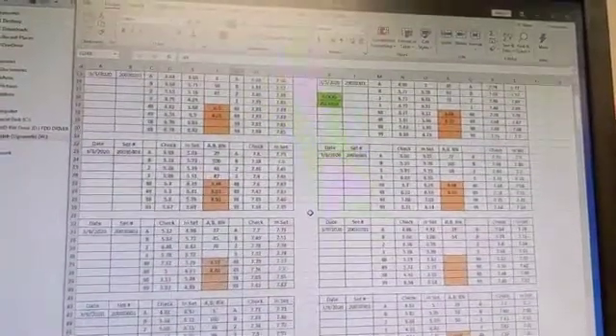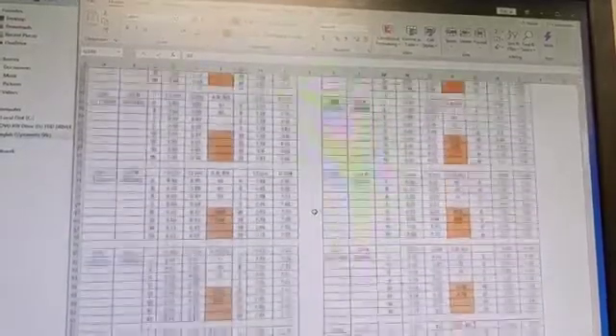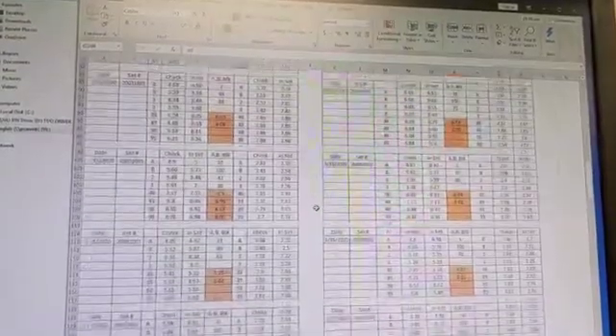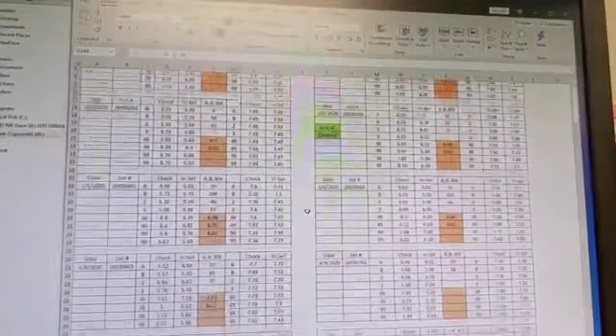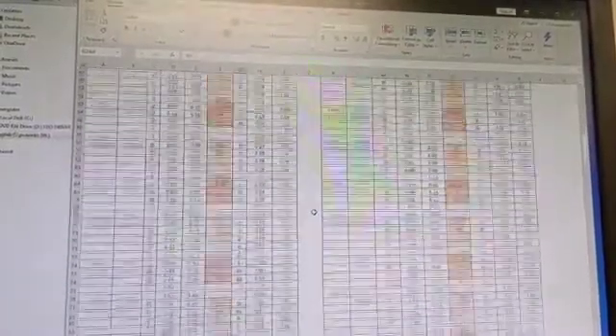After the buffer pH analysis, all of the pH data is entered into various Excel spreadsheets. The computer crunches the numbers to produce a soil report for each sample. The client receives the soil report, along with specific recommendations to amend soil pH.